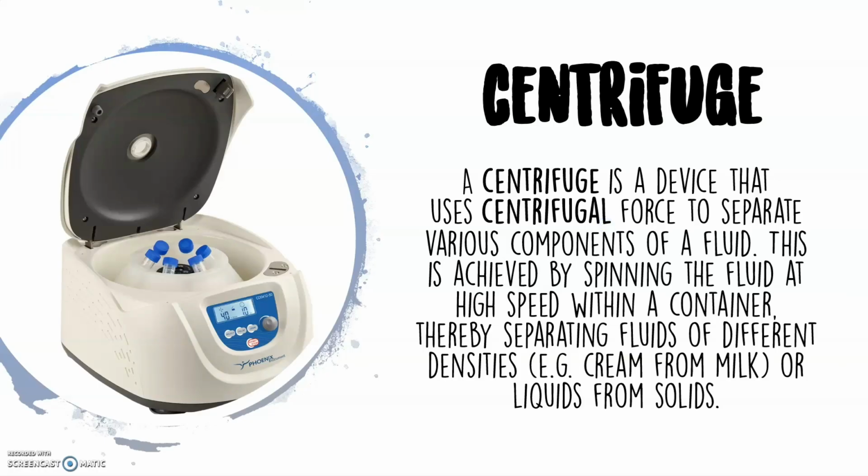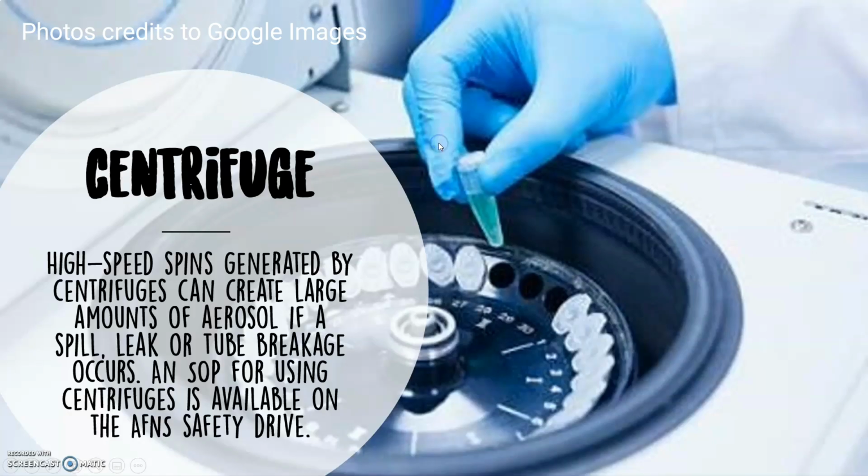A centrifuge is a device that uses centrifugal force to separate various components of a liquid. This is achieved by spinning the fluid at high speed within a container, thereby separating fluids of different densities, for example, cream from milk or liquids from solids.